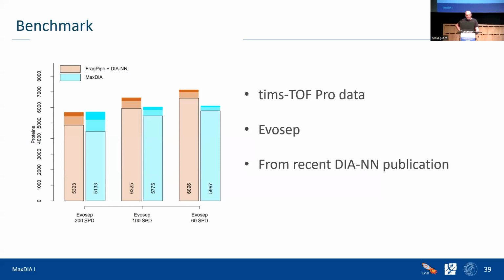I think mostly yes. It's not really something that is happening in MaxQuant, but it's something that happens on the Intel or AMD side. Some of the processors are now very good at using two logical cores for one thread. They're doing a lot of optimization on the chip to put the data exactly in place so that they actually use two cores. So it's not something we do, but it's something that Intel does.